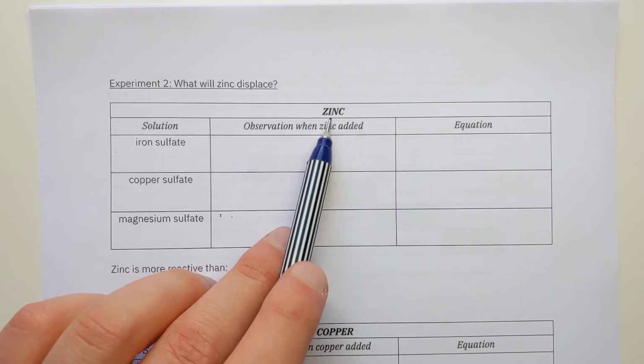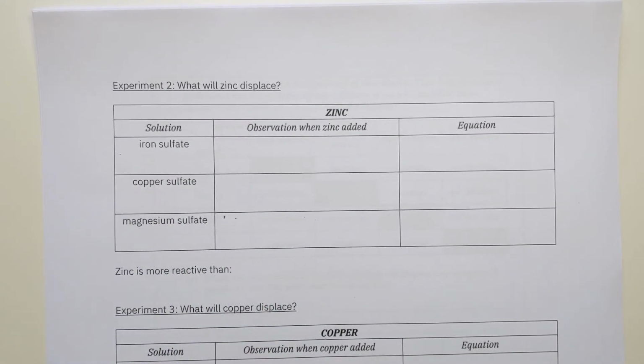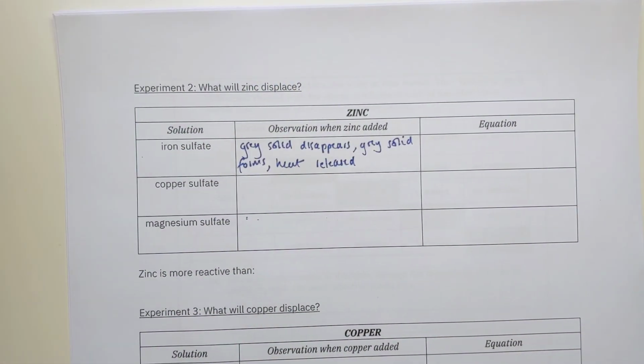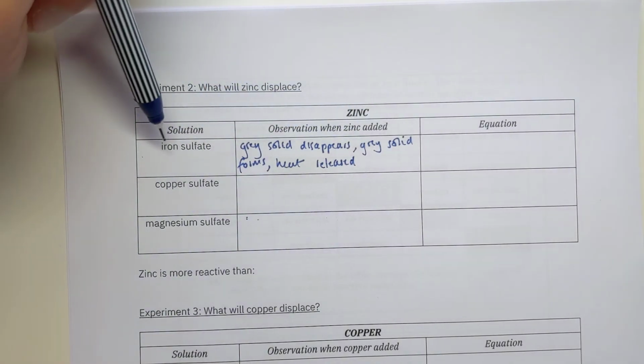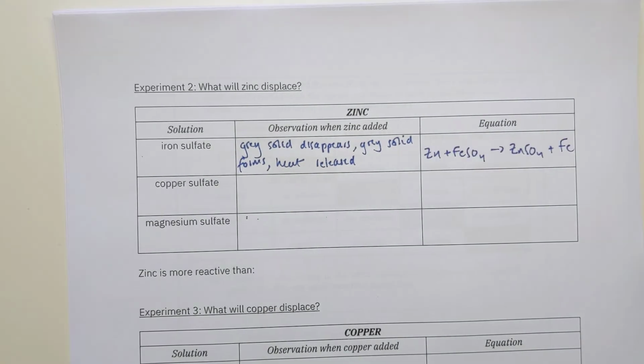So I've got zinc metal by itself, and I've got compounds of the other three metals I'm looking at. If I add zinc to iron sulfate, I get some observations. The grey solid disappears, another grey solid forms, so the zinc is going to disappear, it's reacting, the iron's going to be formed as a grey solid, heat released again, and I get another equation with that one. So the zinc is more reactive obviously than the iron, so the displacement reaction is taking place there.